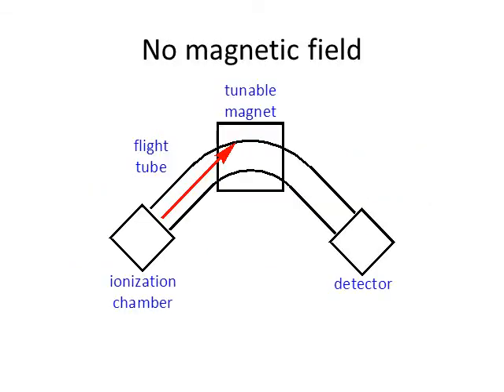These positively charged ions, as seen on the previous slide, are shot out of the ionization chamber because there's a series of negatively charged plates around a small hole which essentially attract the positively charged species and suck them into the next portion, the flight tube. And they're accelerated down this flight tube.